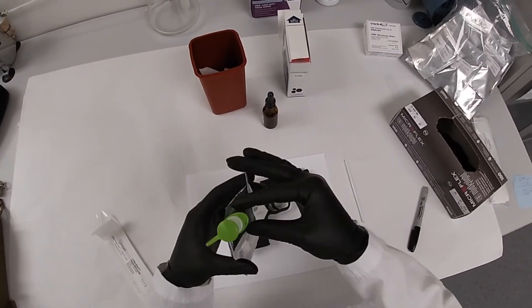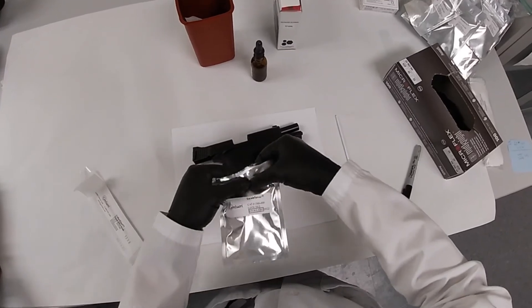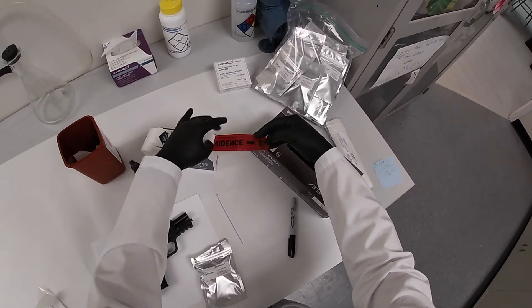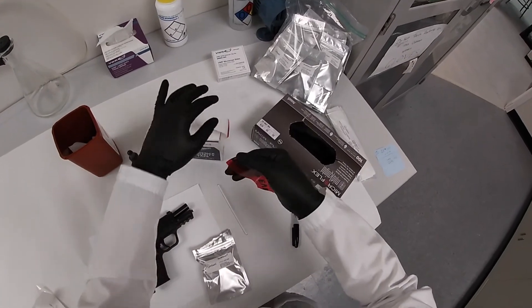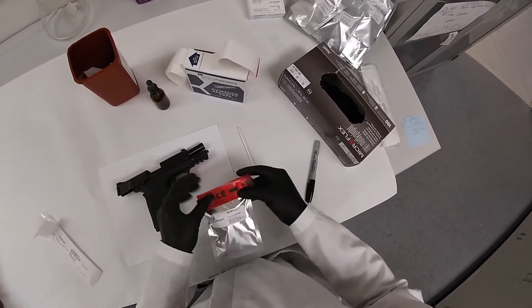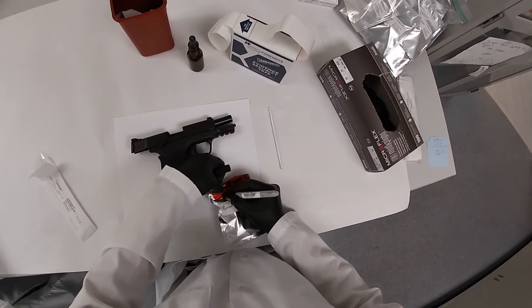Simply place the swab saver back into its protective foil pouch and seal it with the ziplock closure. Seal the pouch with evidence tape and attach any labels or barcodes. Initial and date for chain of custody verification.